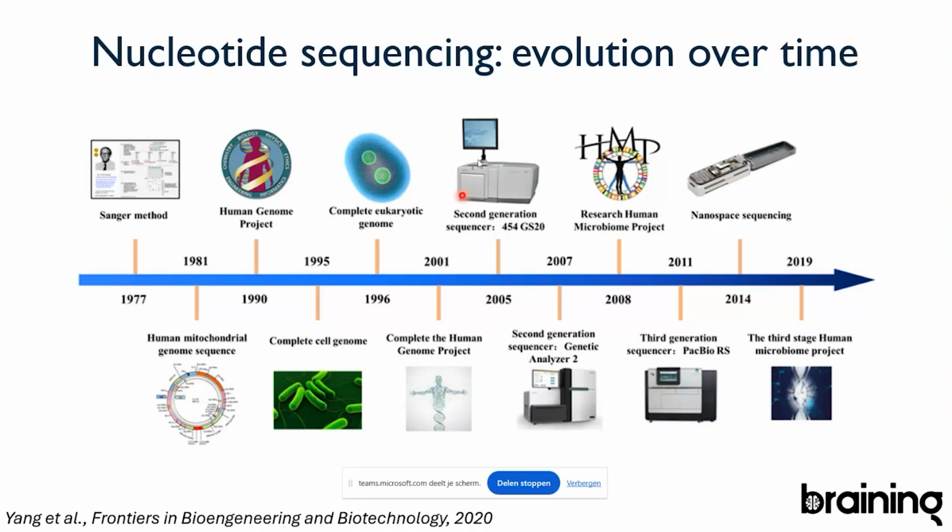So, of course, you all heard about Sanger sequencing, which was developed in 1977. Then there was the next generation sequencing, which became commercially available in the late 2000s. And the sequencing techniques that we will be talking about today are generally called third generation sequencing or long read sequencing, which were developed about 10 to 15 years ago. And to really make you realize the impact and the techniques behind those newer forms of sequencing, I think it's important that I give you an overview of the sequencing methods and how they developed.